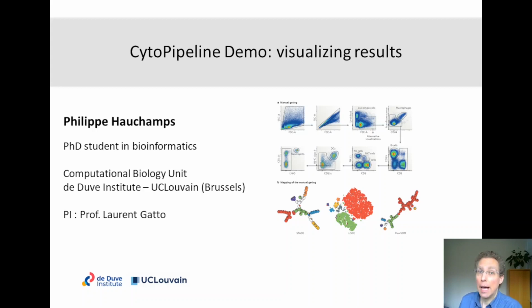Hi everyone, and welcome back to this series of short videos about CytoPipeline, an R tool for building and visualizing pre-processing pipelines for flow cytometry data. In this video, we are going to start with the part I find the most interesting, the visualization of our results. And this is going to be done through a Shiny application.